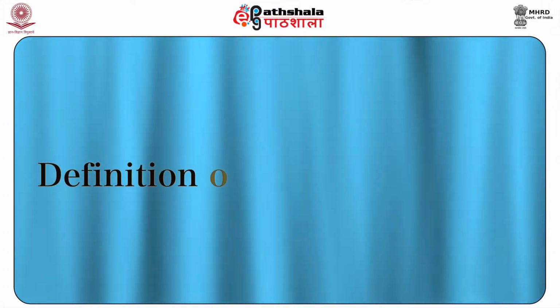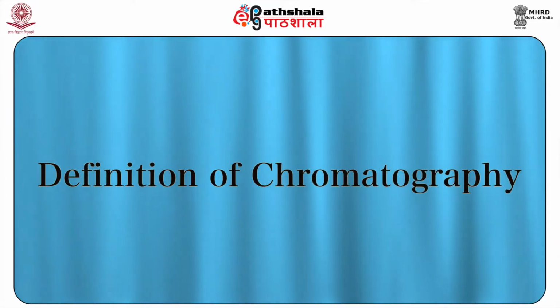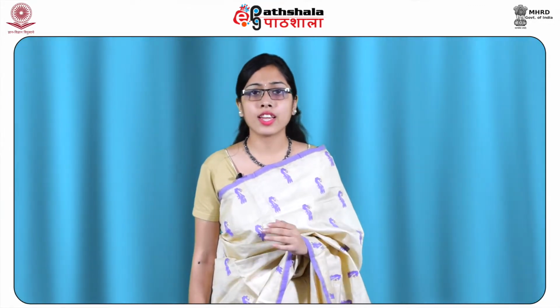Now students, we will start with the definition of chromatography. Chromatography can be defined as the technique of separation of a mixture of components into its individual components by an equilibrium distribution between the two phases.